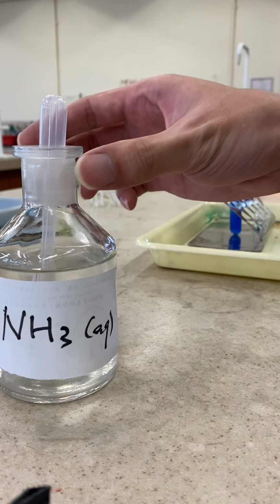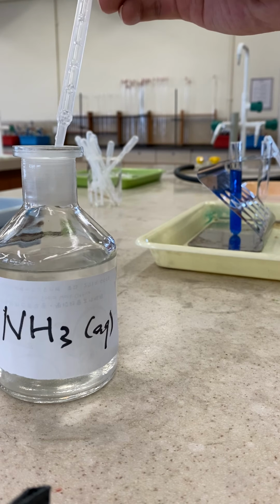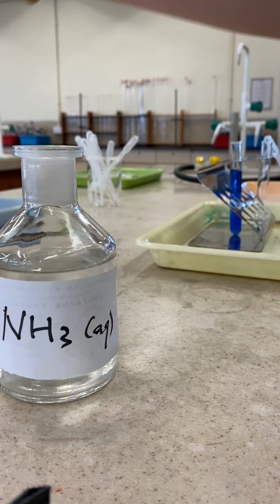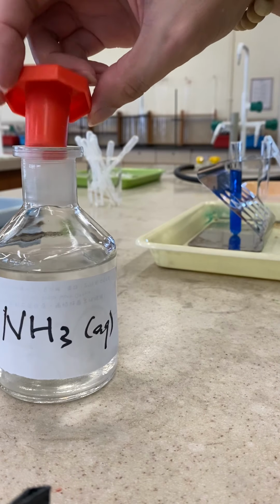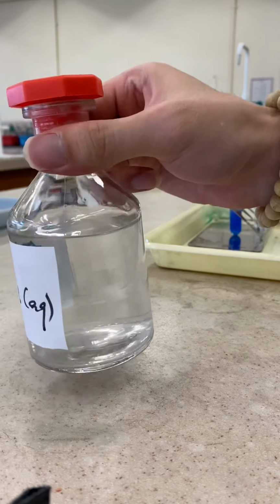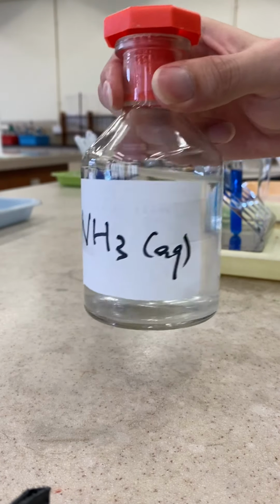So is it clear about this experiment? And be reminded that each time after you use a reagent, stop it again to avoid the reagent inside being contaminated or escaping from the reagent bottle.